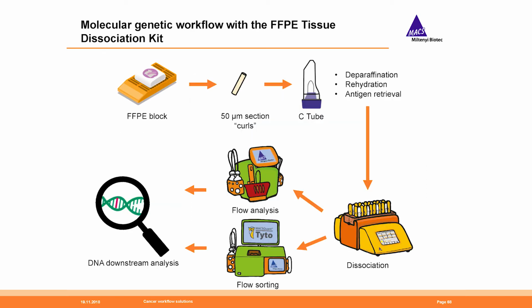And now to the last topic. So this is basically now also something brand new that we just came out with. We're now able to use all these FFPE samples that are out there, and we're able to dissociate them into single-cell suspension and then actually sort them. So this is the workflow basically.